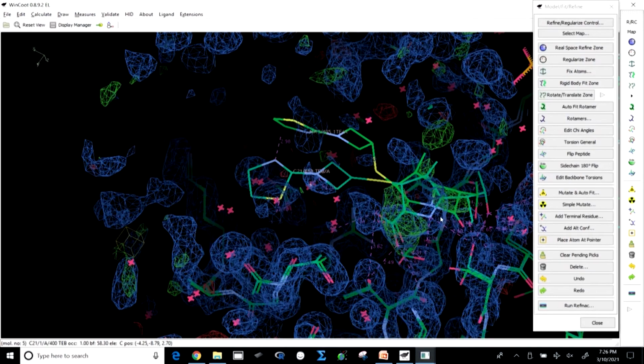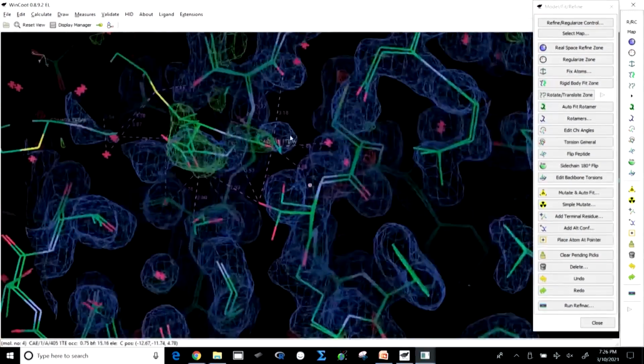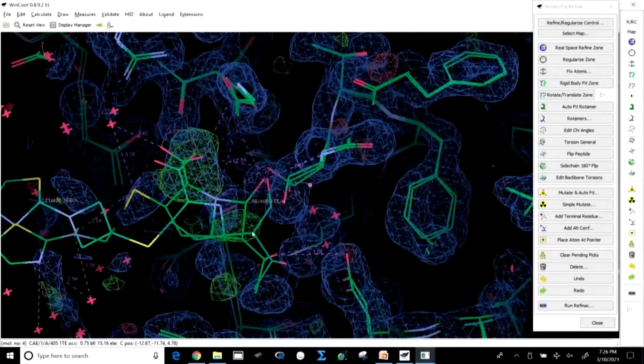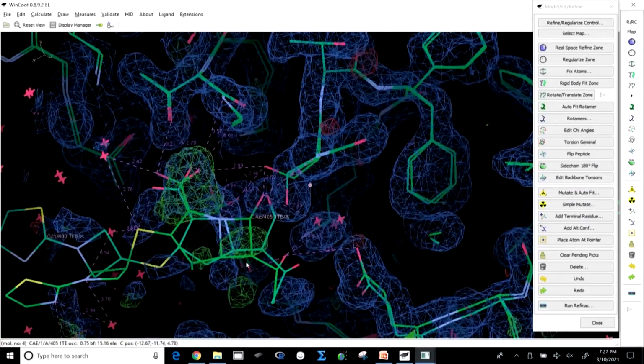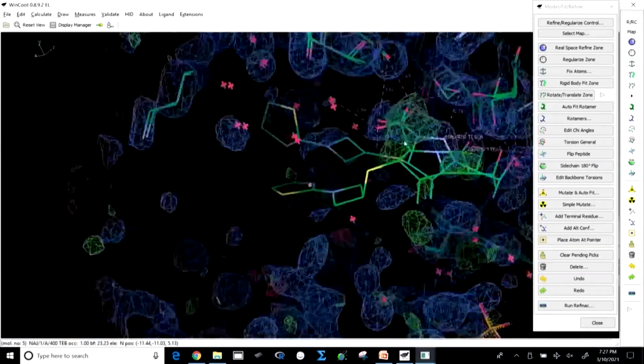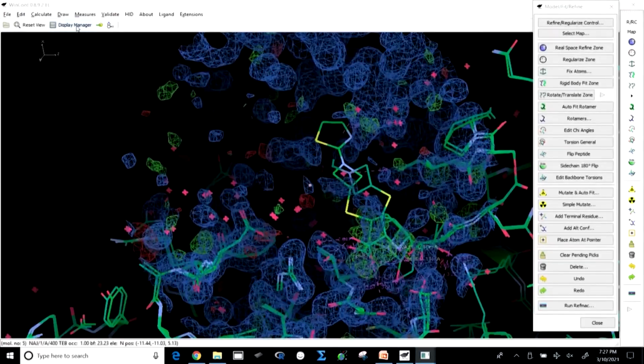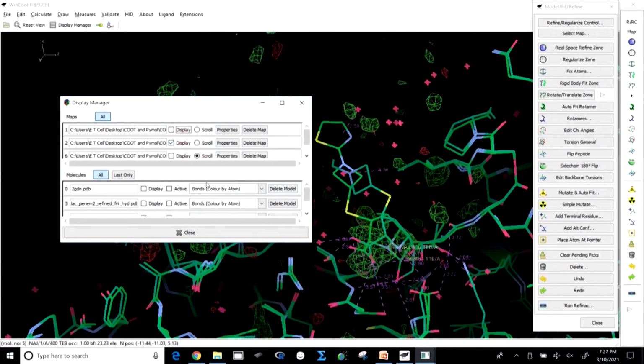But now, if you look at this, you clearly see that for the one structure the 4-membered ring is intact, whereas in the other structure the 4-membered ring is broken. For some moment, to make it more clear, if I take this out, you will clearly see this now.